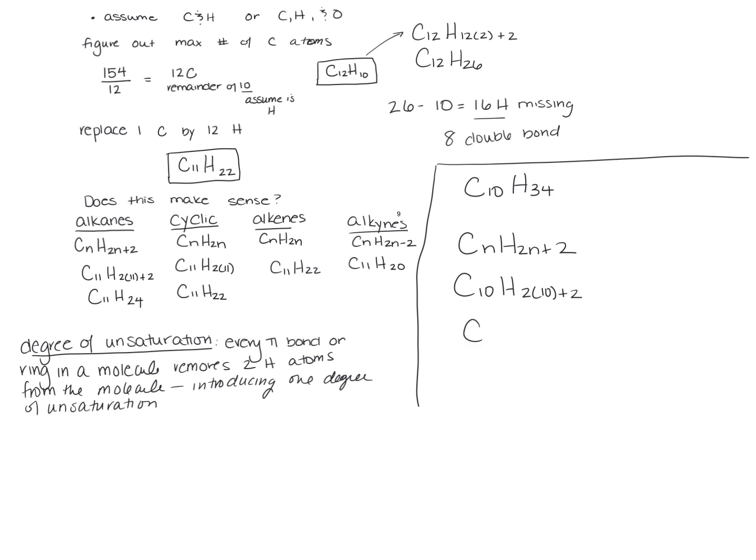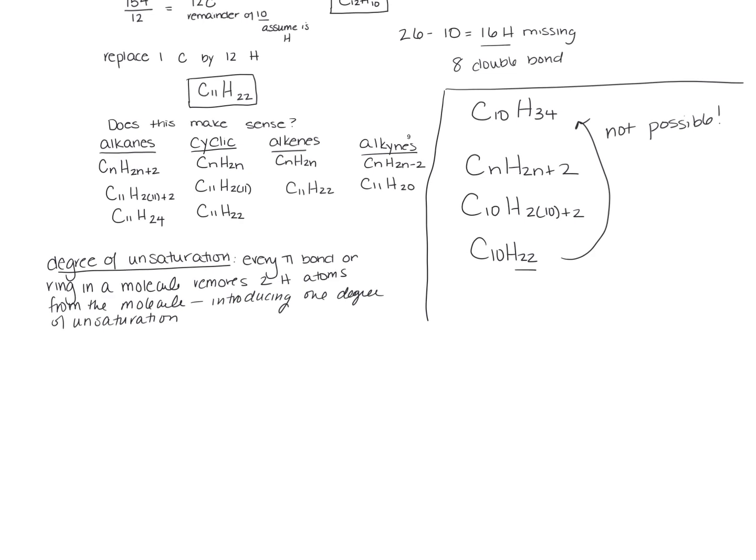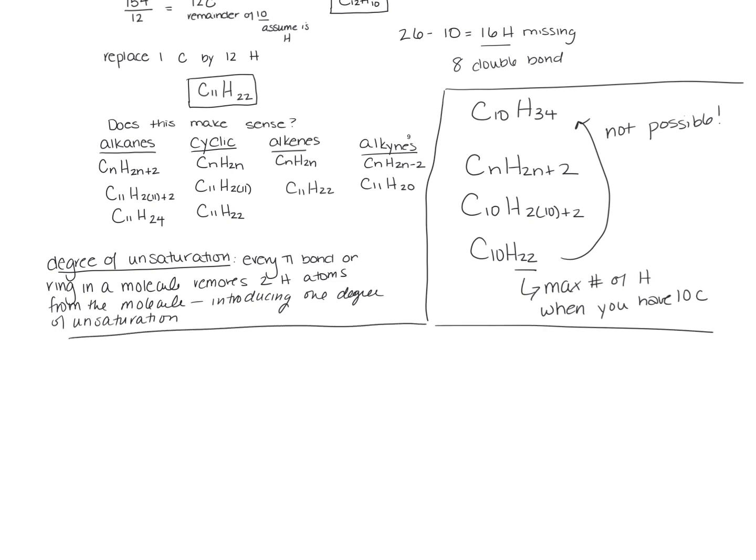And that comes out to C10H22. So this guy here is not possible. Okay, so that's not a possible option. It doesn't make sense because this is the max number of hydrogens when you have 10 carbons.